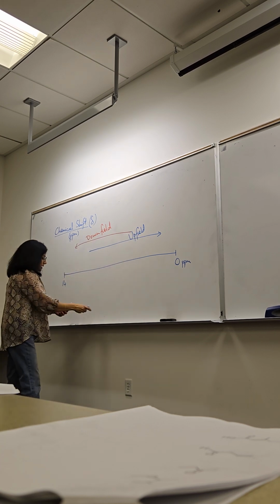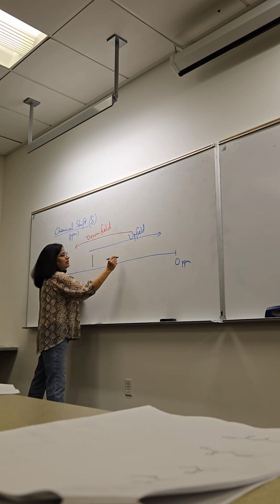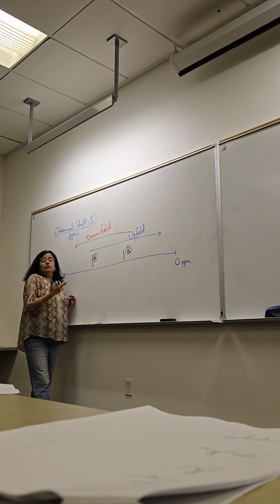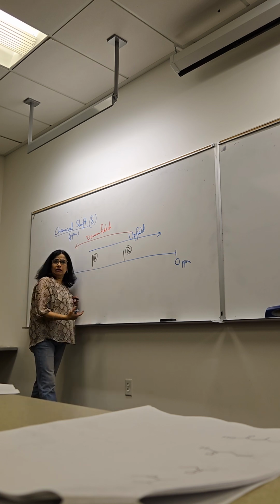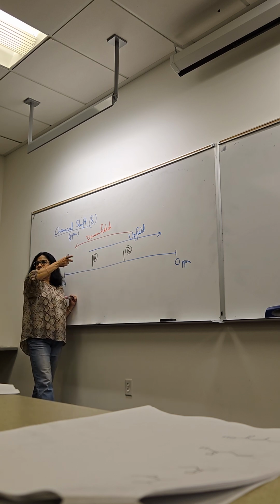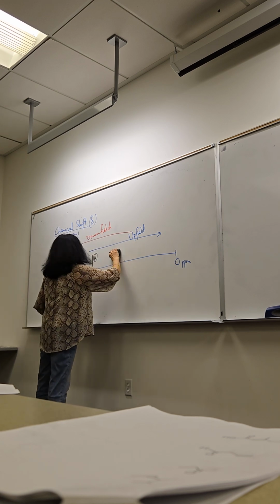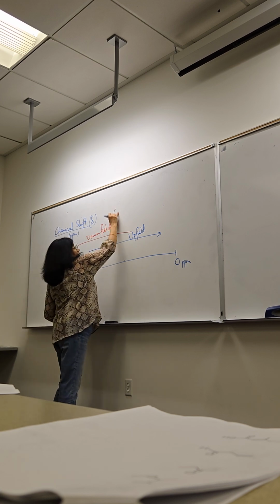So for example, let's say I have two signals, there's one here, I'm going to call this B and I'm going to call this A. We can say A is more downfield compared to B. Or we can say B is more upfield compared to that. So these are comparative terms. We understand that, everybody?